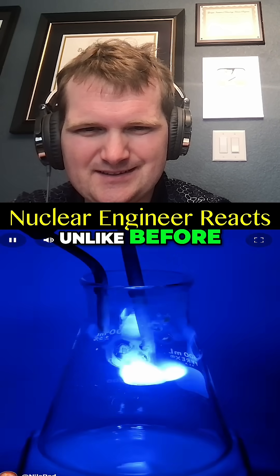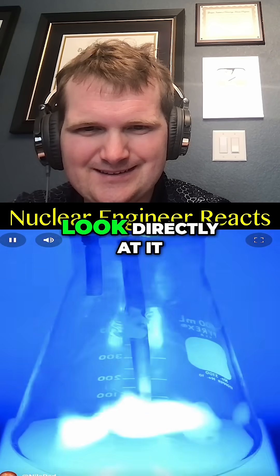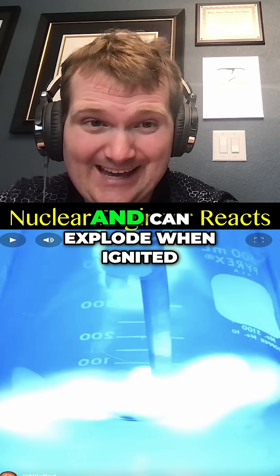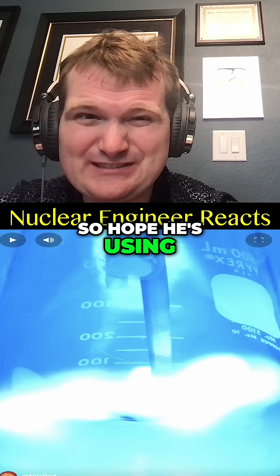In fact, unlike before, it might even be too bright, and it's probably not a good idea to look directly at it. Fine sulfur powder can become suspended in air and can explode when ignited, so I hope he's using a fume hood.